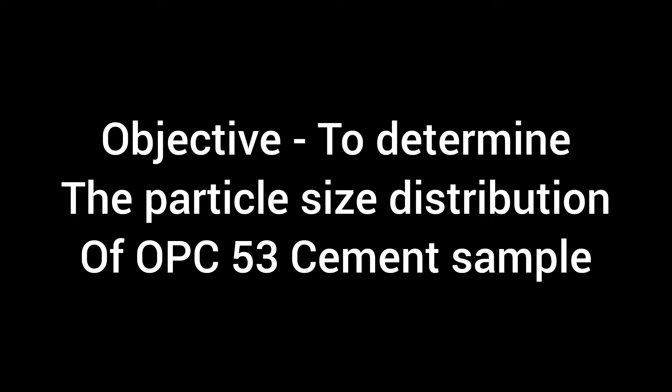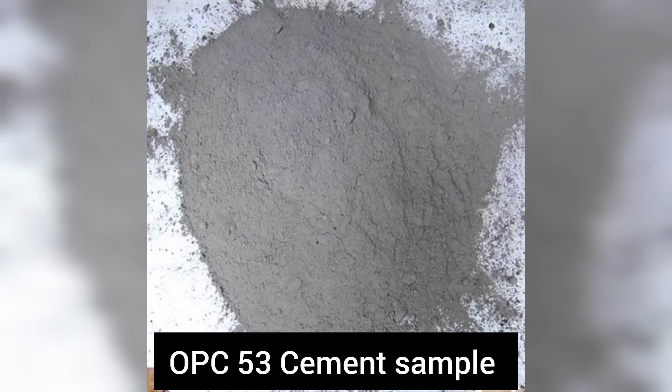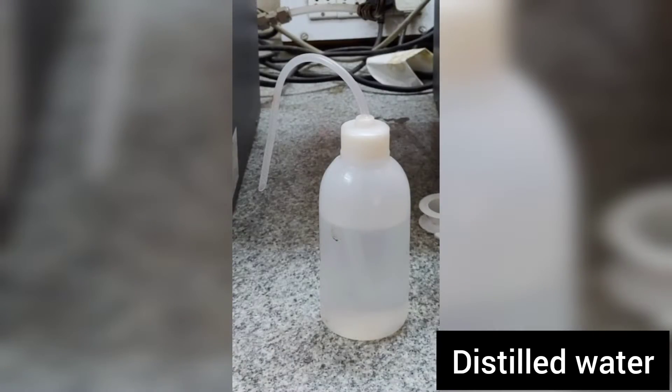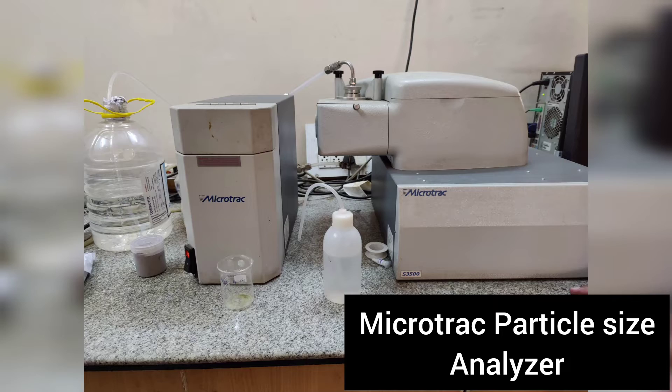The objective of this experiment is to determine the particle size distribution of OPC-53 cement sample. The contents used are OPC-53 cement and distilled water. The apparatus used are Microtrack particle size analyzer and flask.